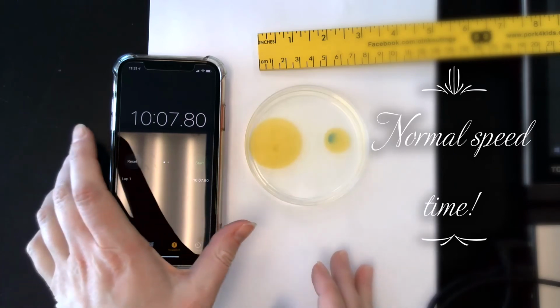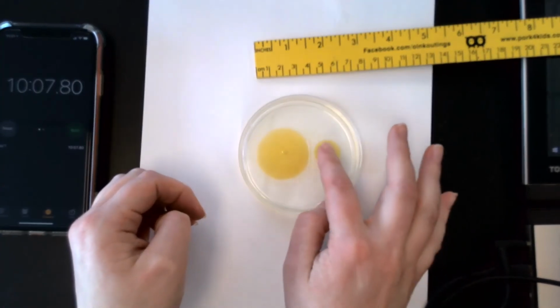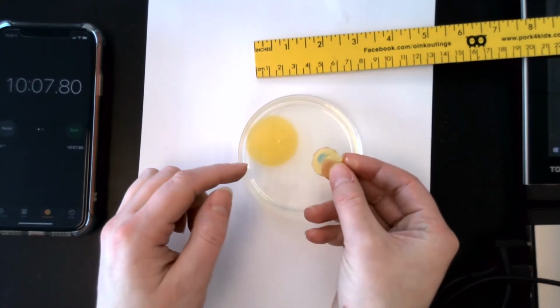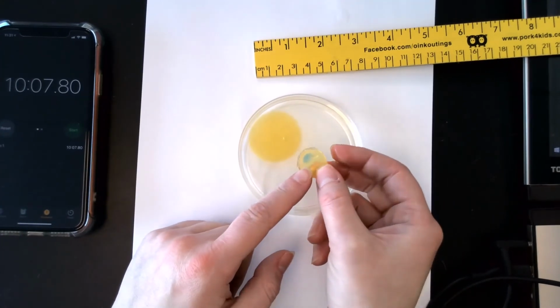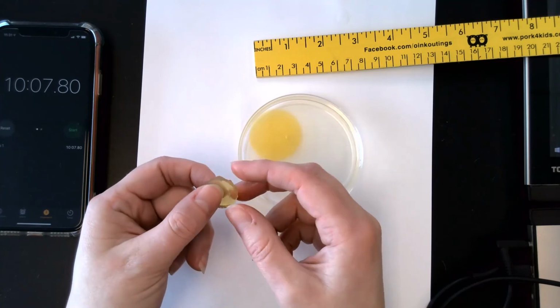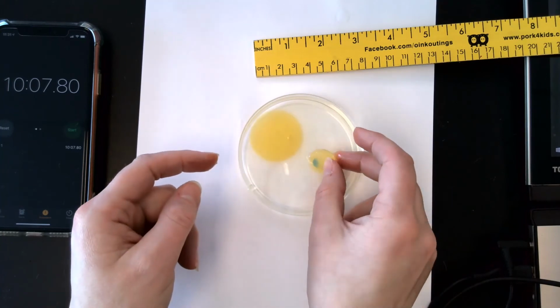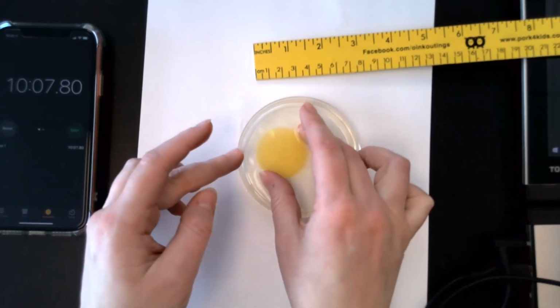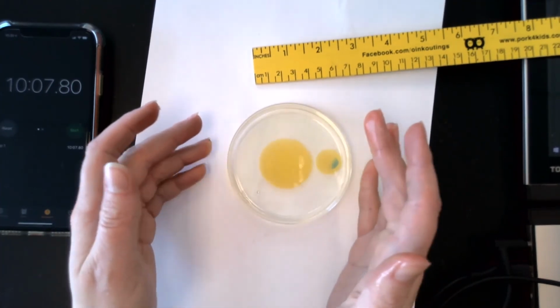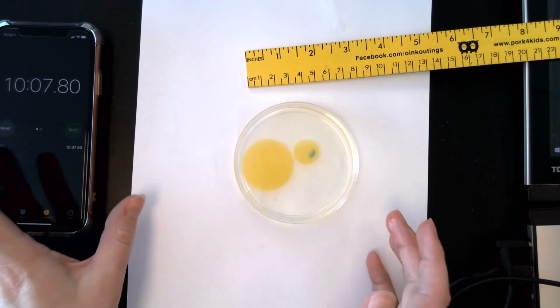Alright, I'm going to stop there, and you'll notice there's still some blue in this little one here, but it looks like that just means there was an inconsistency in here. The moment the color change reached the middle, that's where we should have considered this one done. So just keep that in mind. But that was a quick way to see how they change and which one changed faster. So there was my time again.